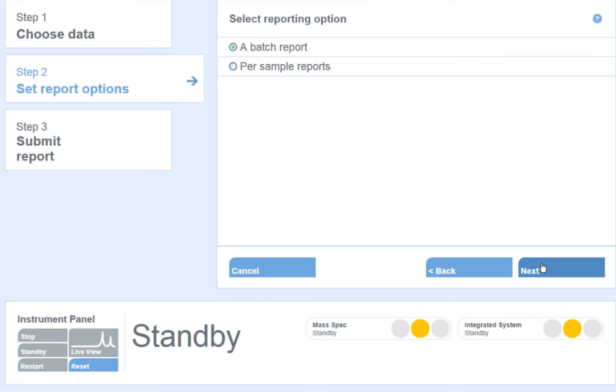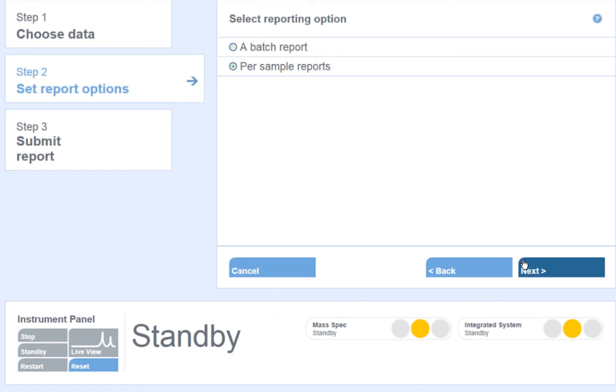Select a reporting option. Here we can either select a batch report where the generated report will be one large file containing all of the samples, or we can select a per sample report where we will generate a separate report for each individual sample processed. I will select a per sample report and click Next.